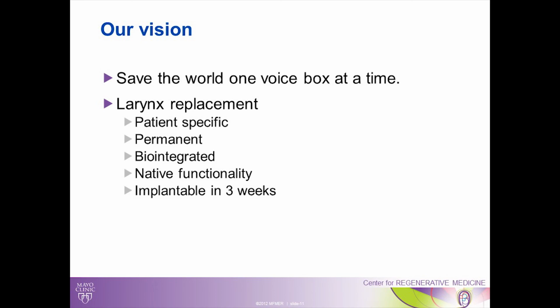of our investigation. And then, importantly for us, this whole thing needs to be able to be done in about 3 weeks, because I don't want to tell a patient, a cancer patient, sorry, you have to wait 3 months until we form your scaffold. That just doesn't work. So in order for this to be clinically feasible, it has to be done in about a 3-week time frame.